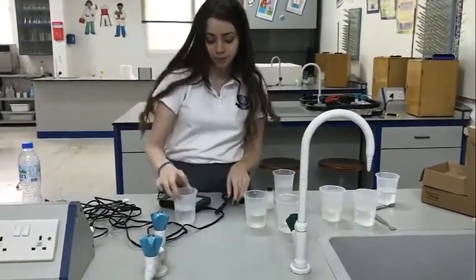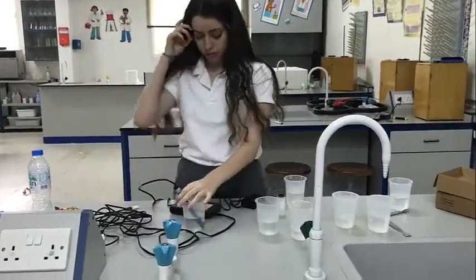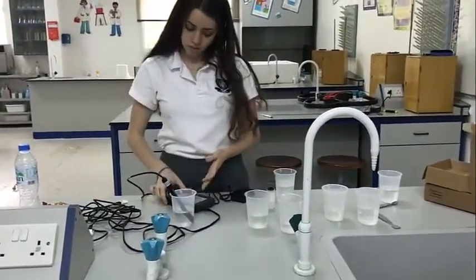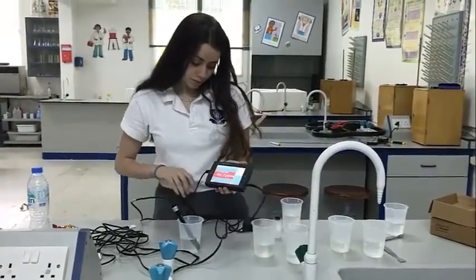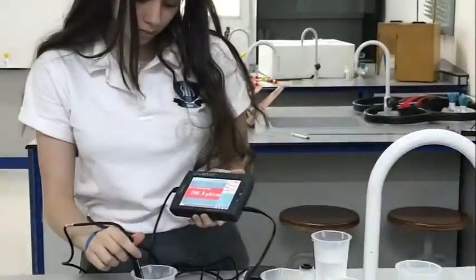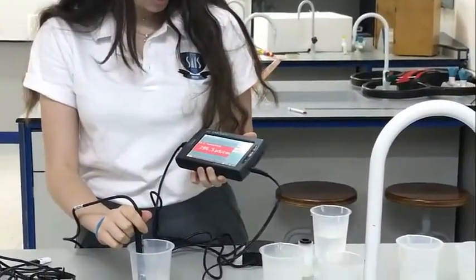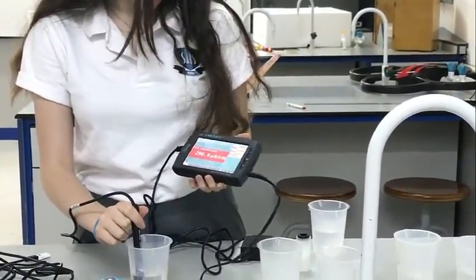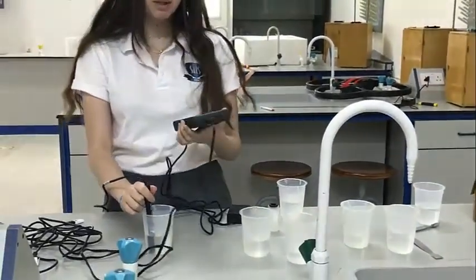It's distilled water. So let's try the distilled water first. It's continuing to change. Okay, it's approximately 296.7 microsiemens per centimeter.